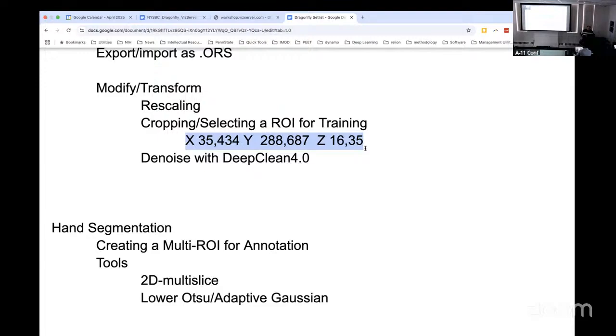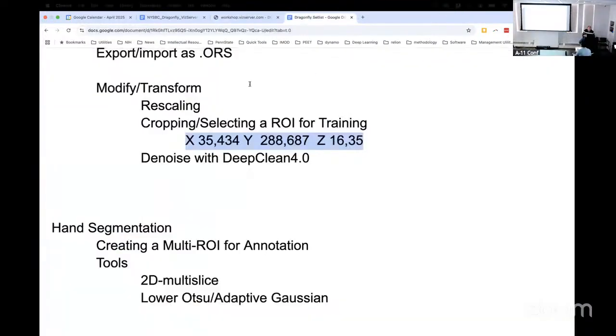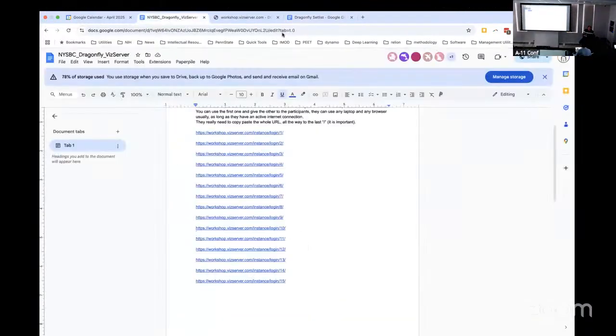I didn't make them nice round numbers. That work for anyone? All right. Let me know if you need those numbers back. What I wanted to show you was, let me do it for myself. 35, 434.